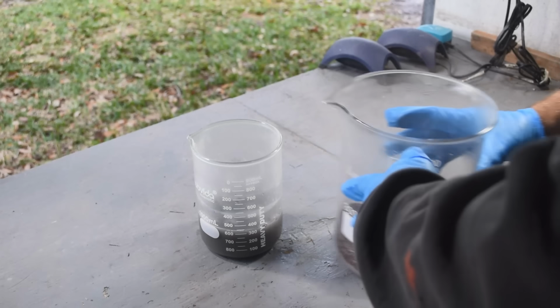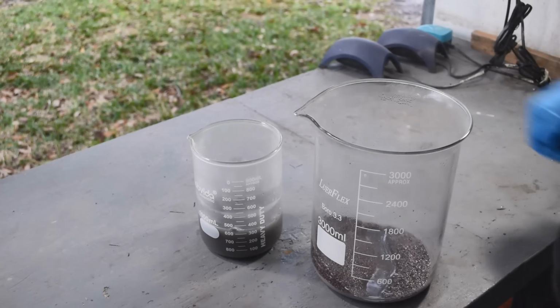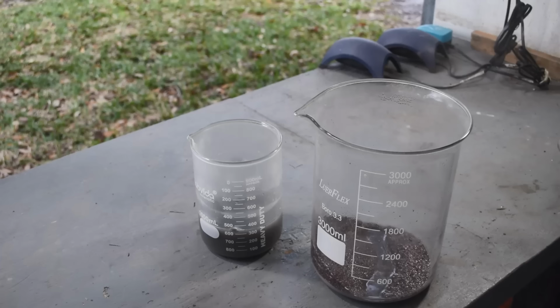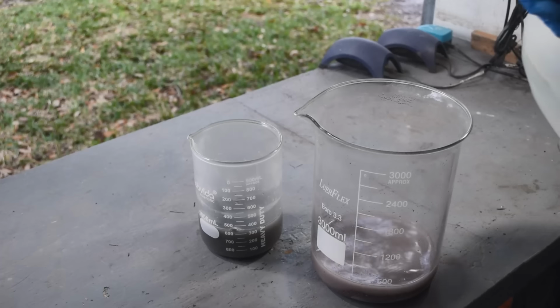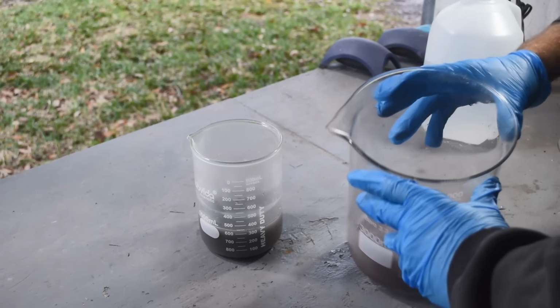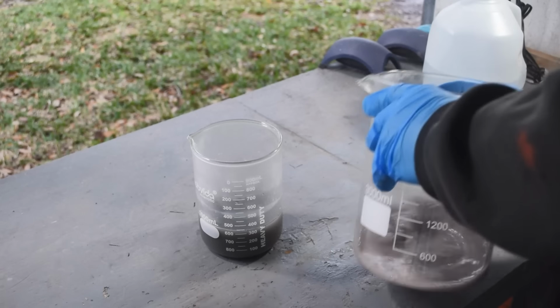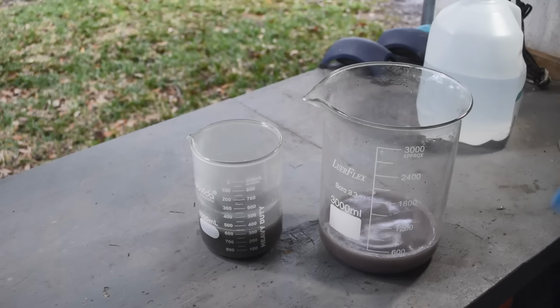And good. I really don't see those crystals anymore. Whatever they were, they dissolved in the water. Excellent. So what I'm going to do now is give this another rinse in distilled water. Let that settle a little bit. I'll pour it off. And then I think we'll be ready to go to aqua regia, or at least as ready as we're going to be.